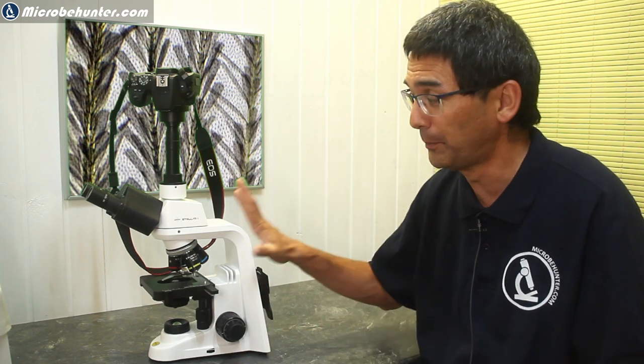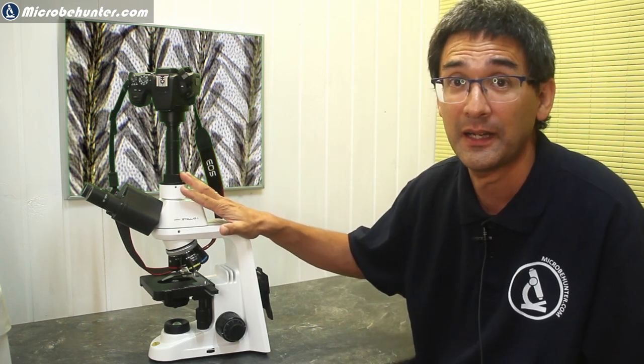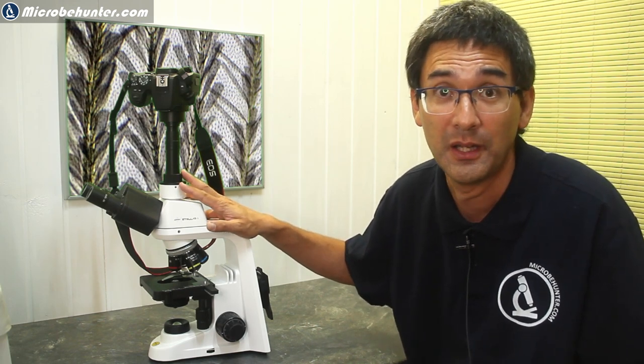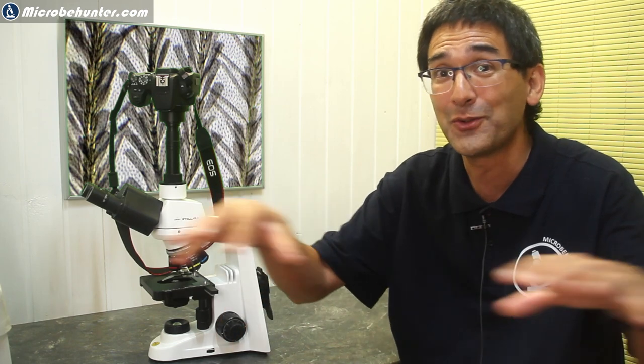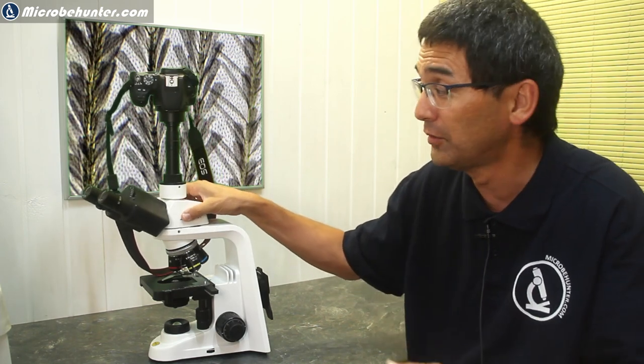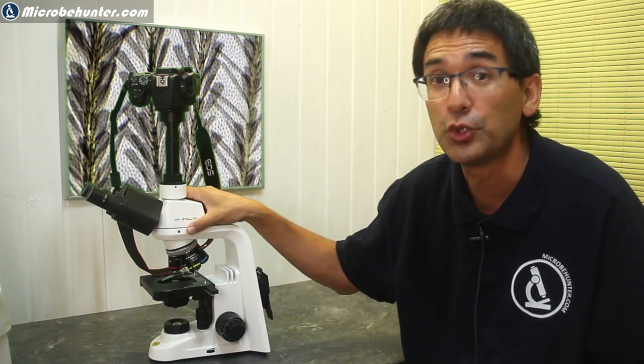A little bit unusual for a microscope of this size is the fact that it actually is operated with a USB power. Now, this is something that I've not seen in other microscopes before. This allows it to be used also with battery. And I think this is also one of the reasons why I think the target group of this microscope is also educational use where you might not have a power supply on every table. And then the students can grab a microscope and then they can actually connect a battery pack to the microscope and then use the microscope without actually needing a regular power supply. And I think this is also an advantage by having a trinocular or binocular head to be removed, like this is that you have two students sitting in front of the microscope and it's easily possible for them to share the microscope.